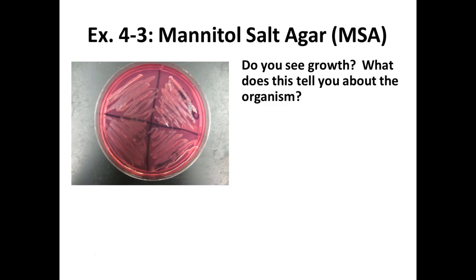So, what do you see on this plate? You see growth? Yeah, that's actually growth. Of course, I asked them to do a streak plate and they couldn't follow directions. You guys have seen this picture of this plate before on a quiz. They just put a new inoculum of bacteria in each quadrant instead of dragging from one quadrant to the other. But that's okay. We've got growth, right?